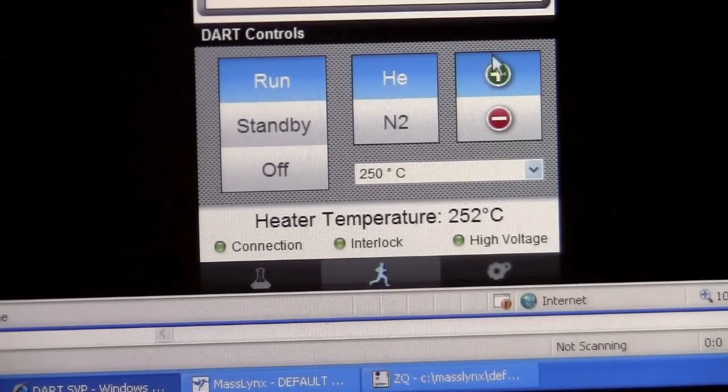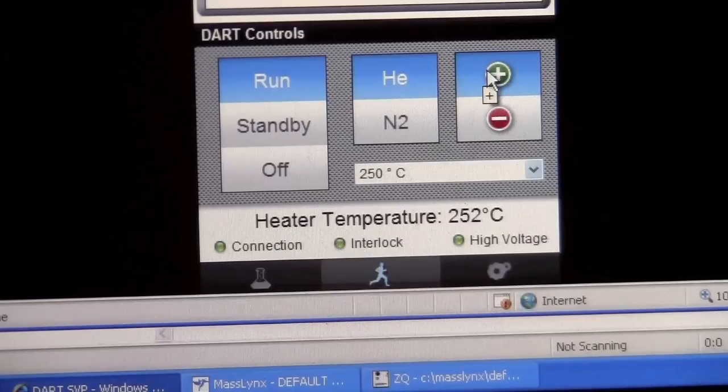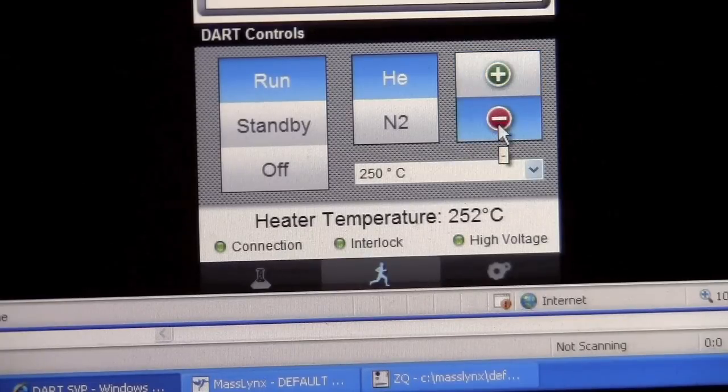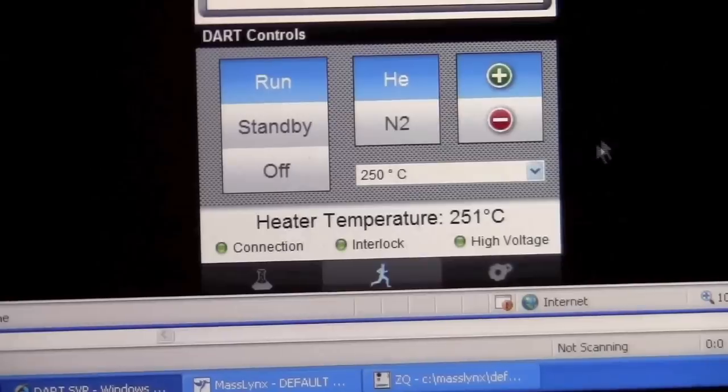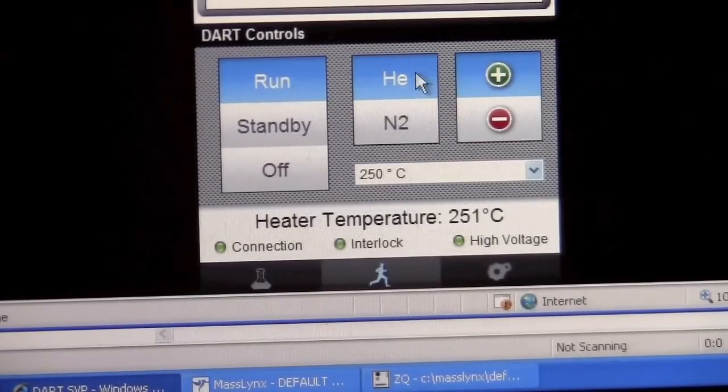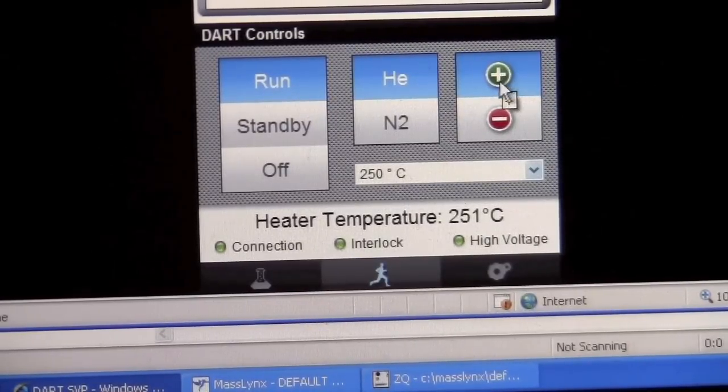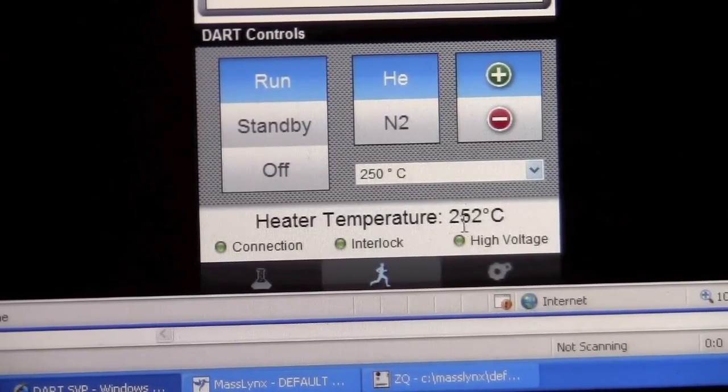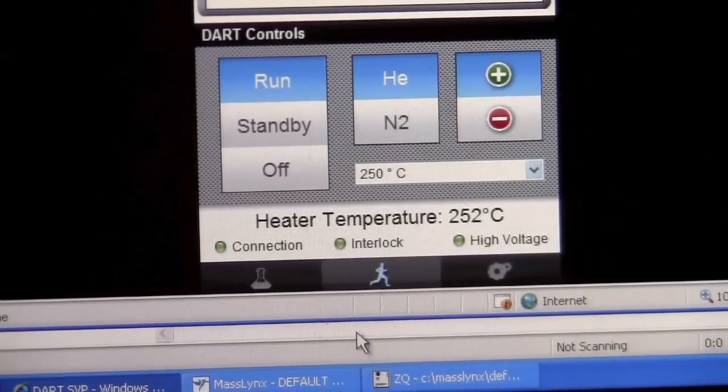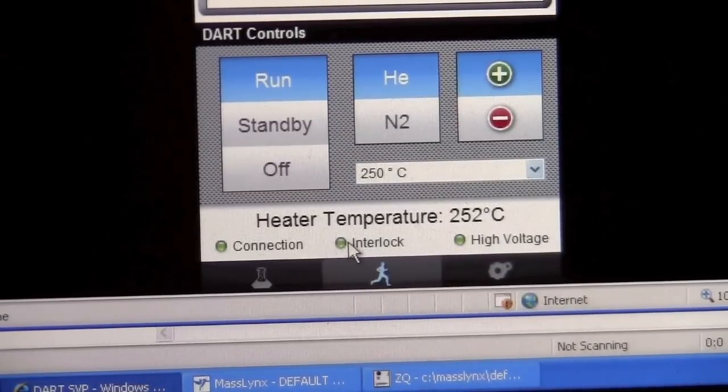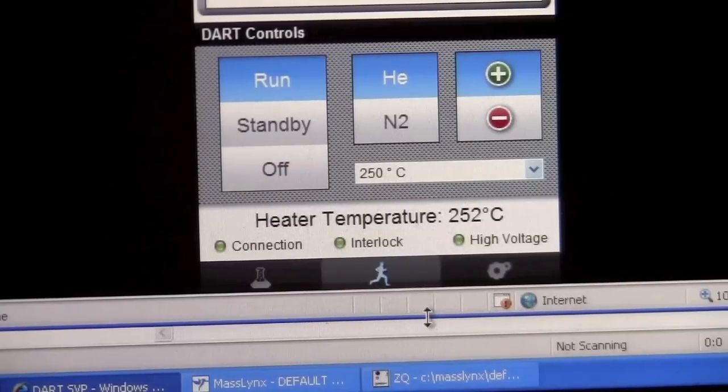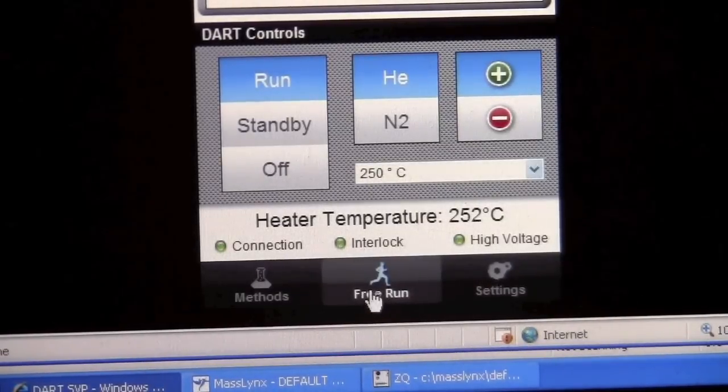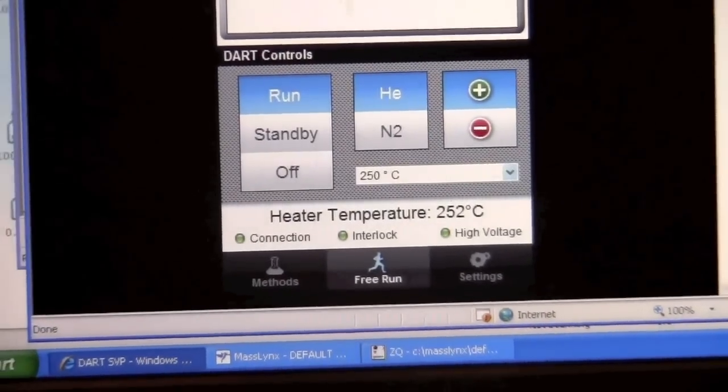While it's running we can switch it to positive ion mode or to negative ion mode. I'm going to show you positive ion mode right now. So in this case the source is producing ions. It's on run helium with positive ions. The temperature is set where we want. The connection is green, interlock is green, high voltage is on, and we have free run mode. So the source is producing ions.